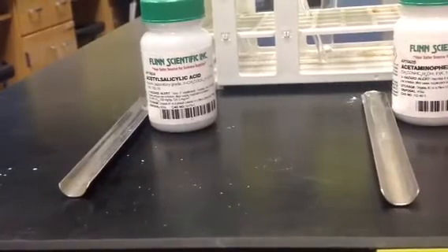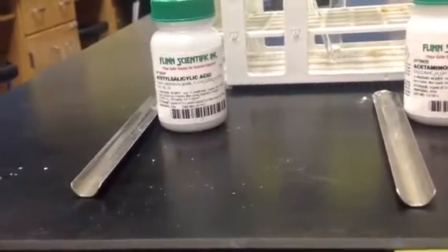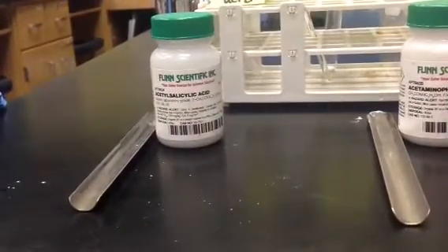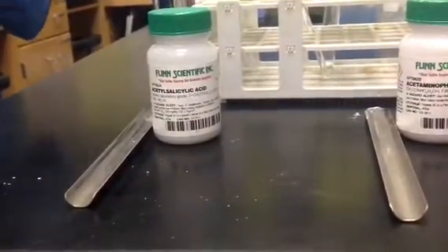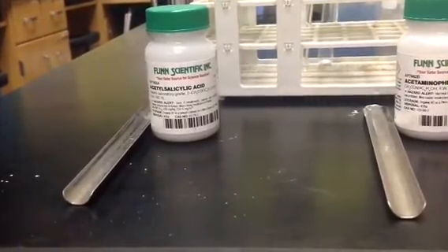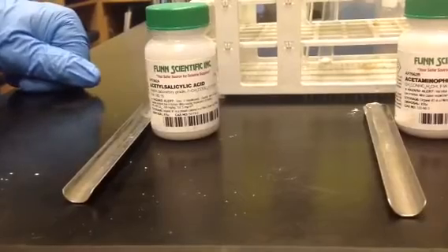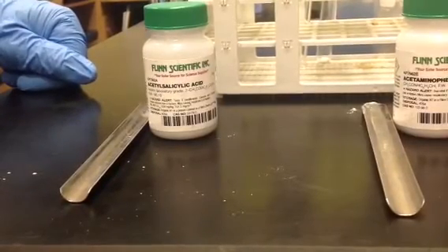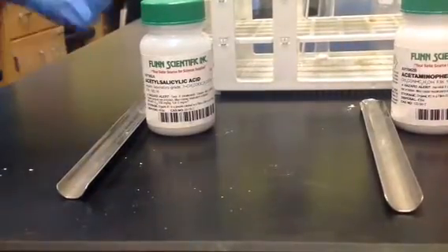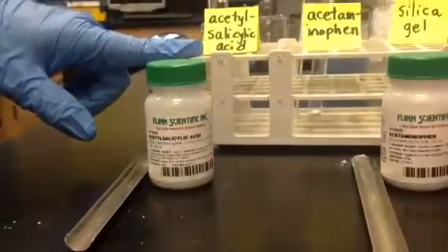Okay, this is the introductory activity for the organic inquiry lab where we're going to separate a synthetic pain relief mixture. So first, before we can plan our separation, we need to know some solubility information on each of our components of a pain relief tablet.